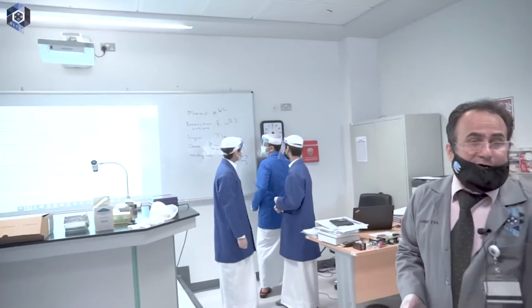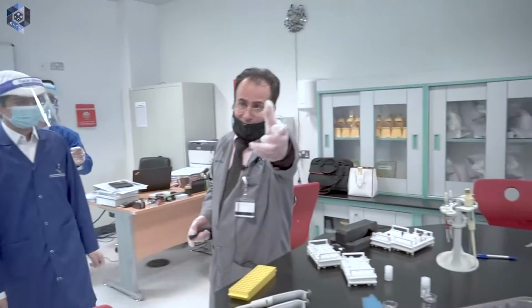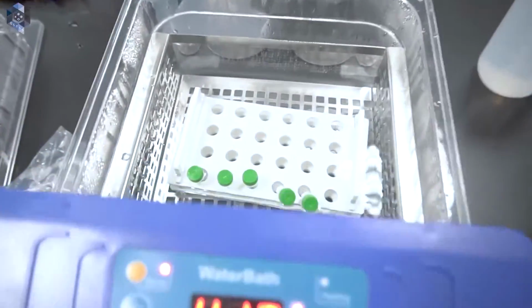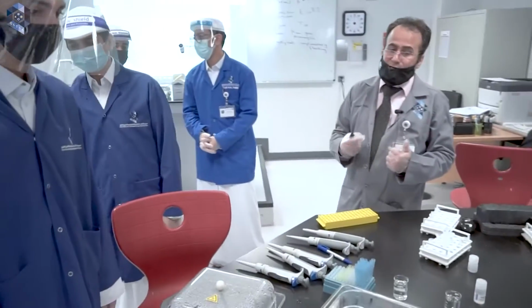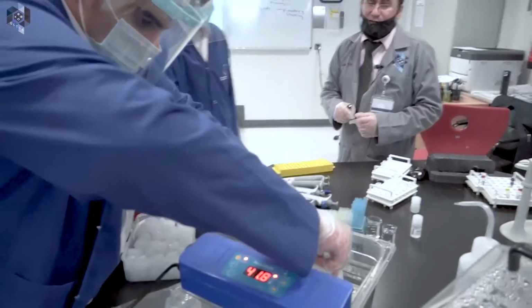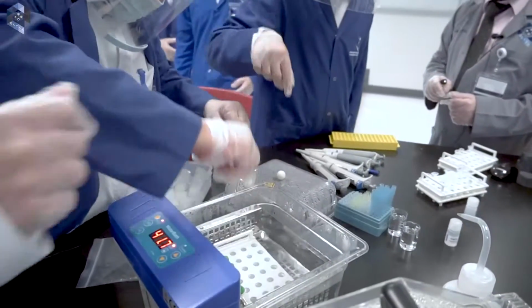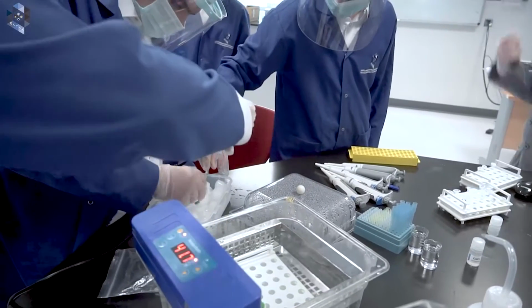Now, quickly return them to the ice. Mary, bring the new ice bucket here, the smaller one. Bring it quickly. Time is critical. Now, gently remove the centrifuge tubes and place them in the ice. We want to shock the bacteria with cooling and warming.